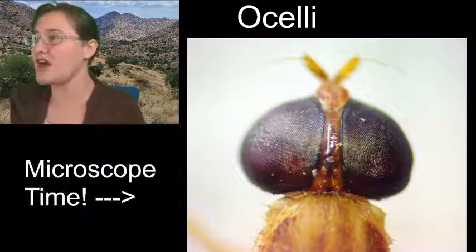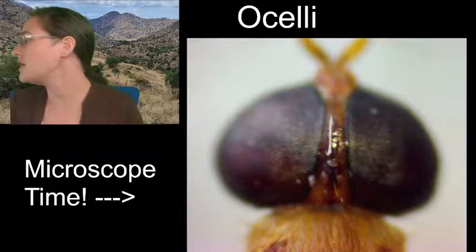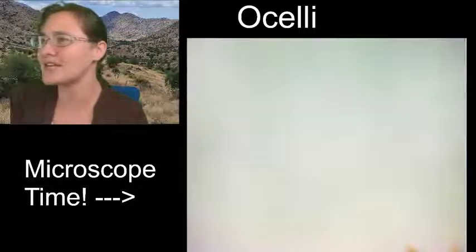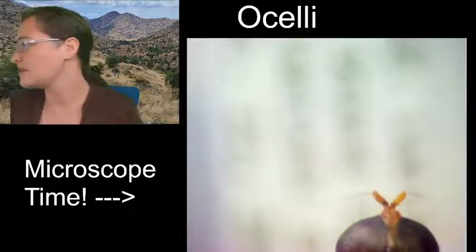All right, so we've got the eyes and the ocelli taken care of. I'm going to turn this off, and we can go ahead and zoom down, and we are going to look at the antenna. Oh, hey, where'd the antenna go? Moved it too far.